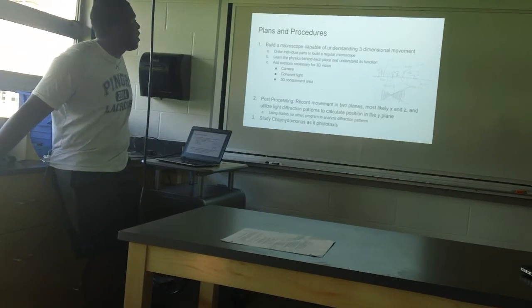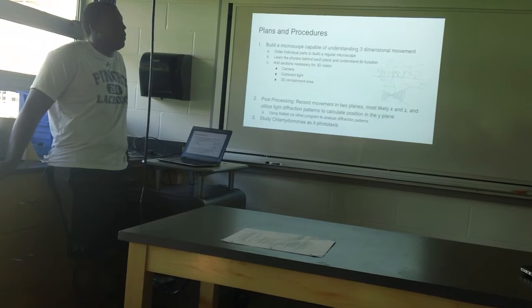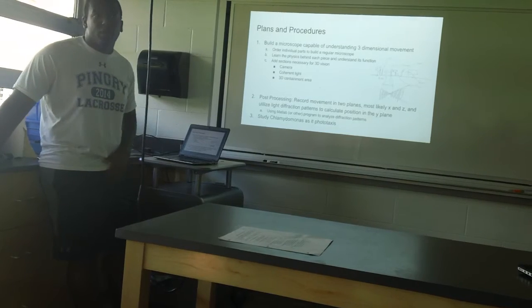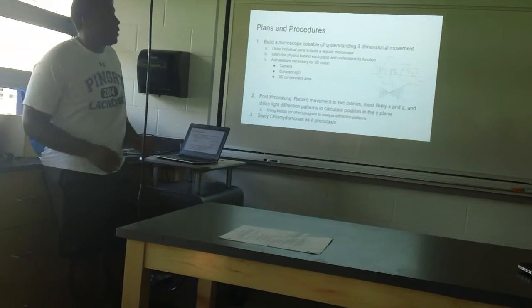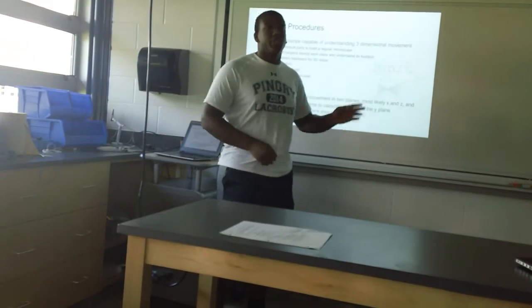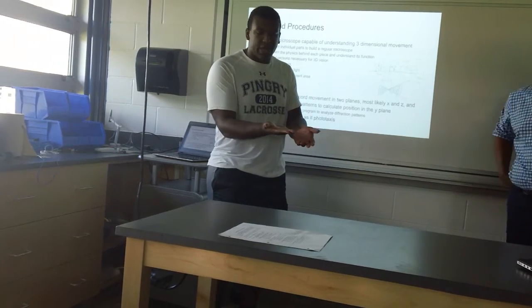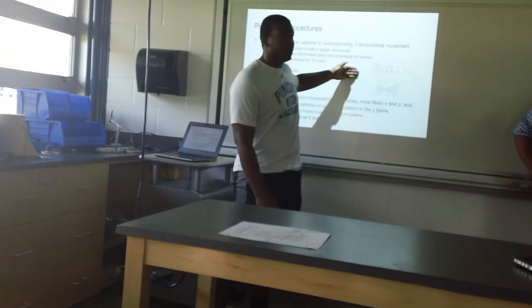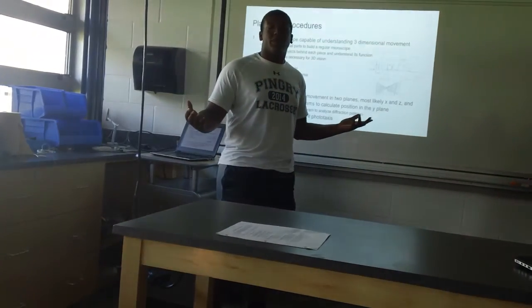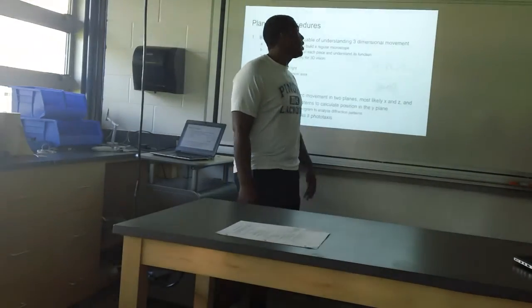So, first of all, from the microscope aspect, we would be ordering individual parts, understanding the things behind each piece and how they work, why they work, where to put what thing where. This is sort of a loose schematic. It wouldn't be your traditional microscope where you look down it with the section on the bottom. It would be more like an extended, deconstructed telescope in a rough sense, and we would essentially work it like that.